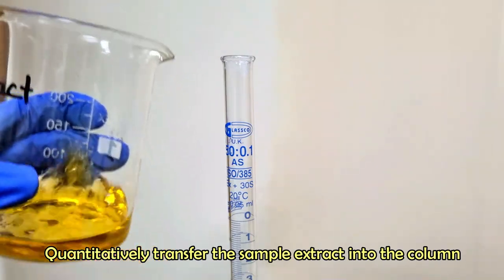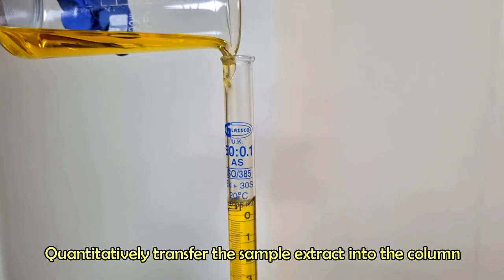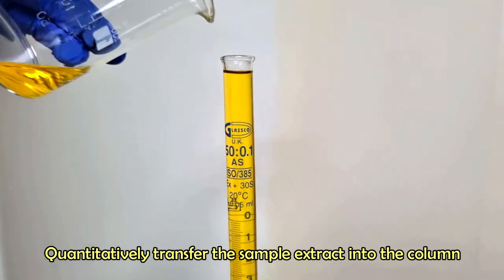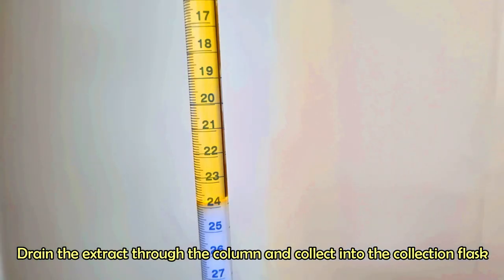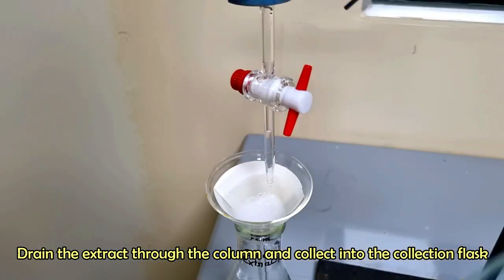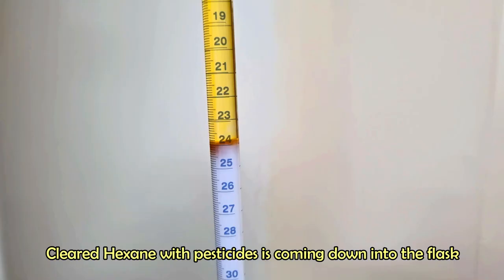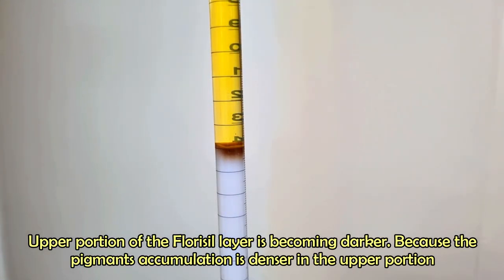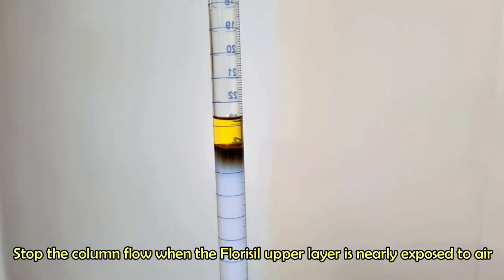Quantitatively transfer the sample extract into the column. Drain the extract through the column until the florisil upper layer is nearly exposed. Stop the column flow when the florisil upper layer is nearly exposed to air.